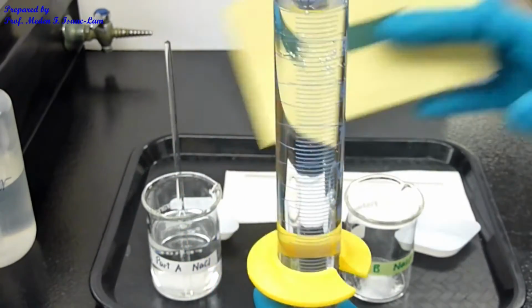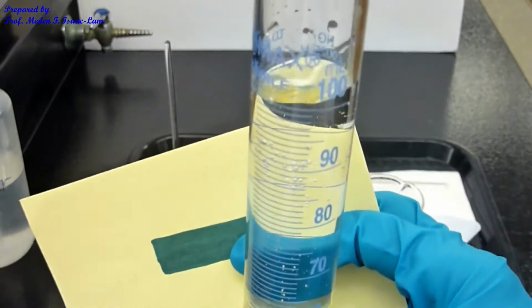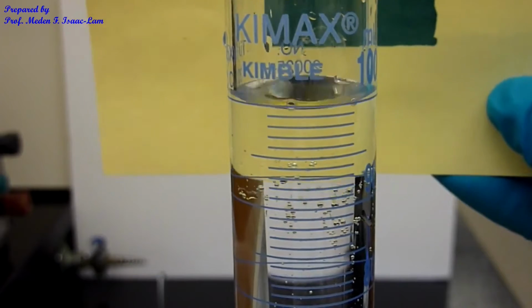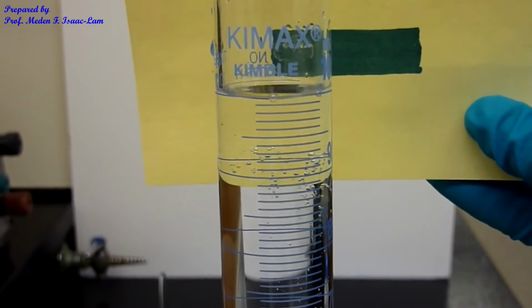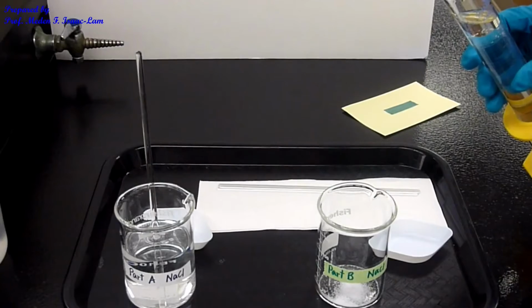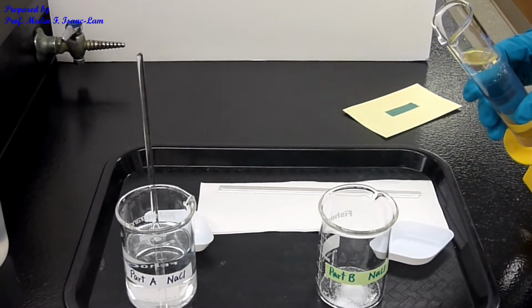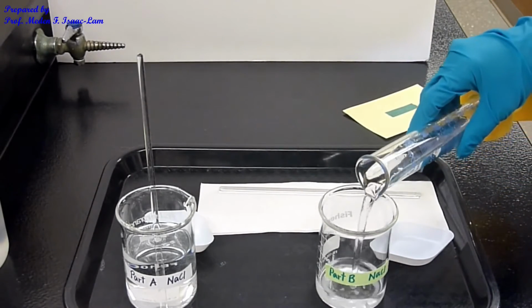Again, when you're reading this, it's going to be the lower meniscus. So 100.0 ml of water. I'm going to pour and dissolve the salt in 100 ml of the water, the same thing.